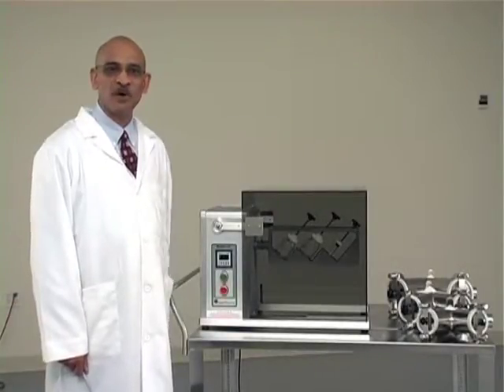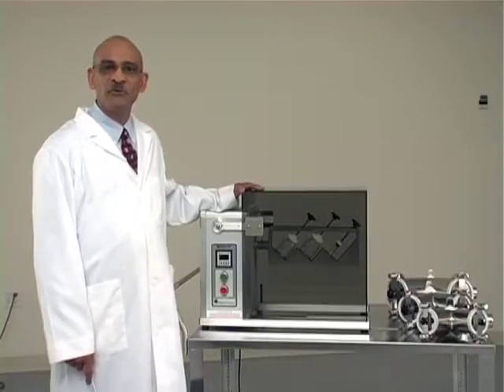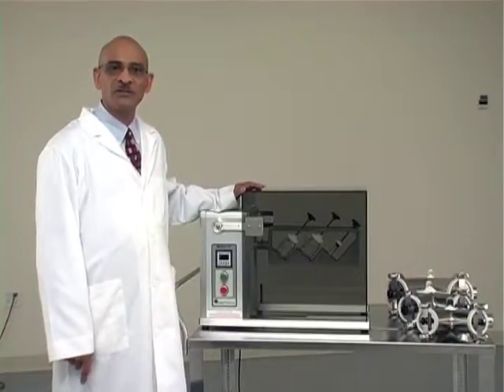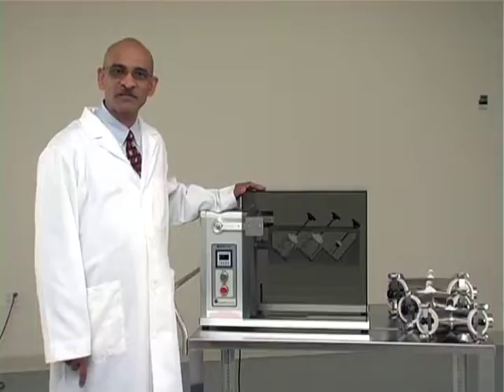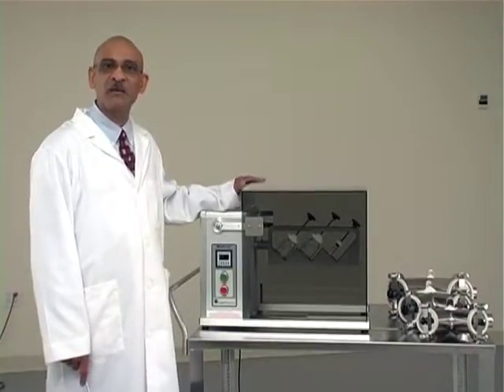I will demonstrate Globe Pharma's Mini Blend Powder Blender. Before moving on to the actual demonstration of the machine, I would like to discuss the features of this machine briefly.